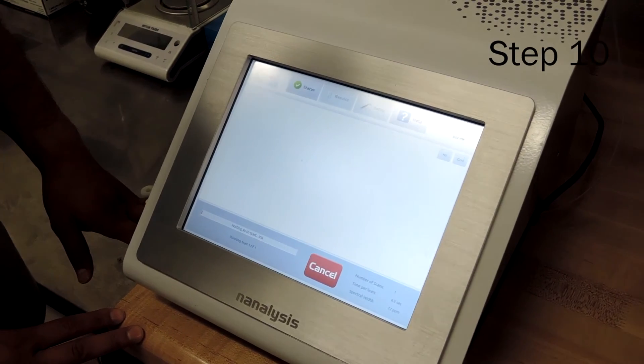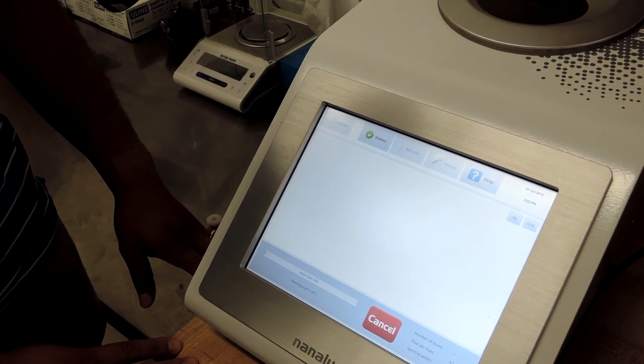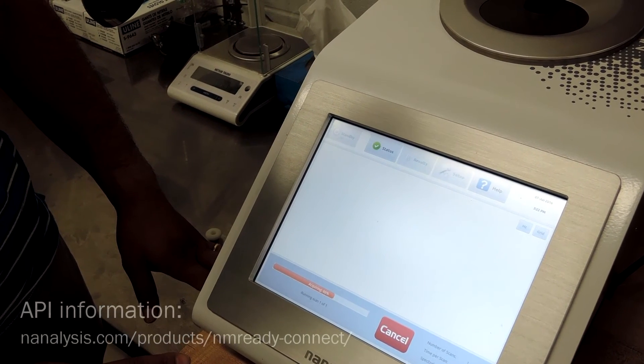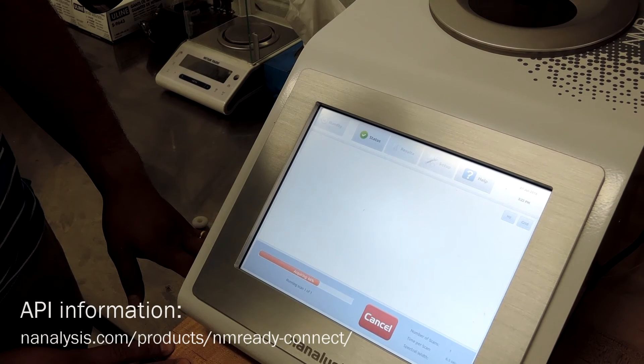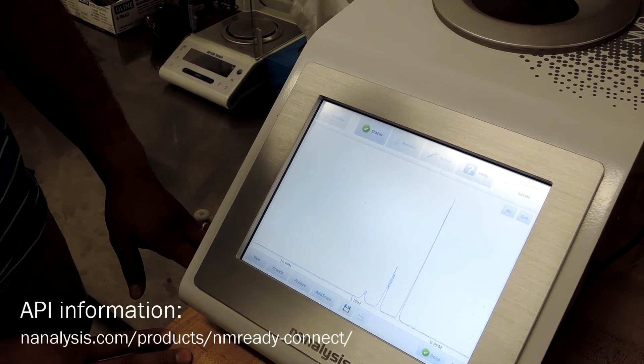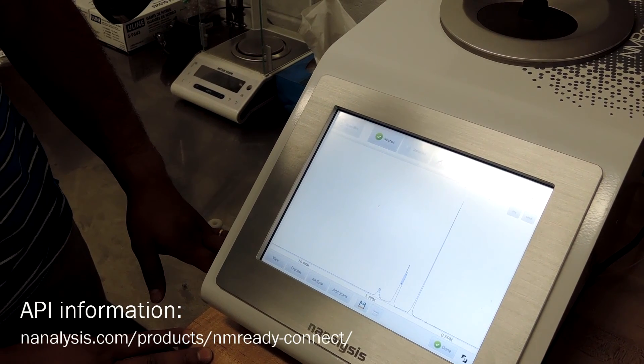Acquiring data can be done manually by setting up your experiment and simply hitting the go button. Alternatively, you can use our kinetics module or even our API for application developers to further customize your experiments. If you are interested in any of these advanced features, please contact your sales representative.